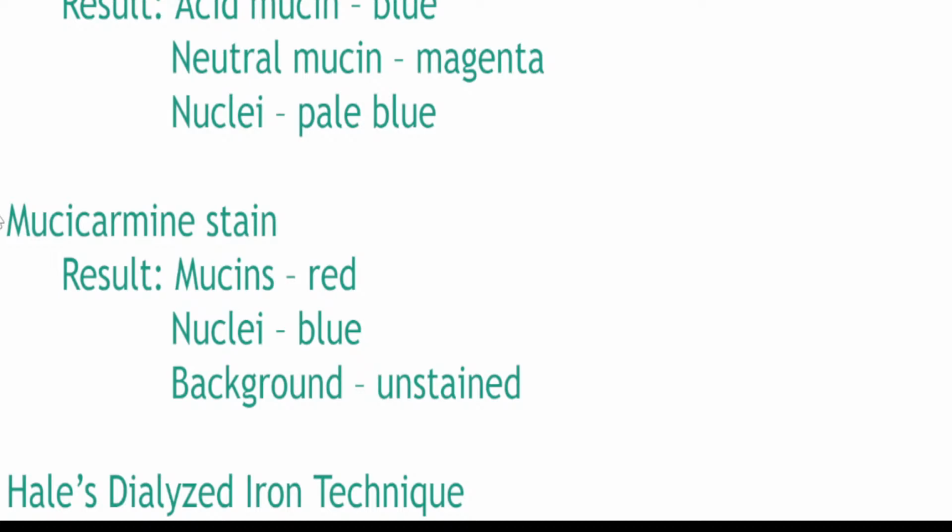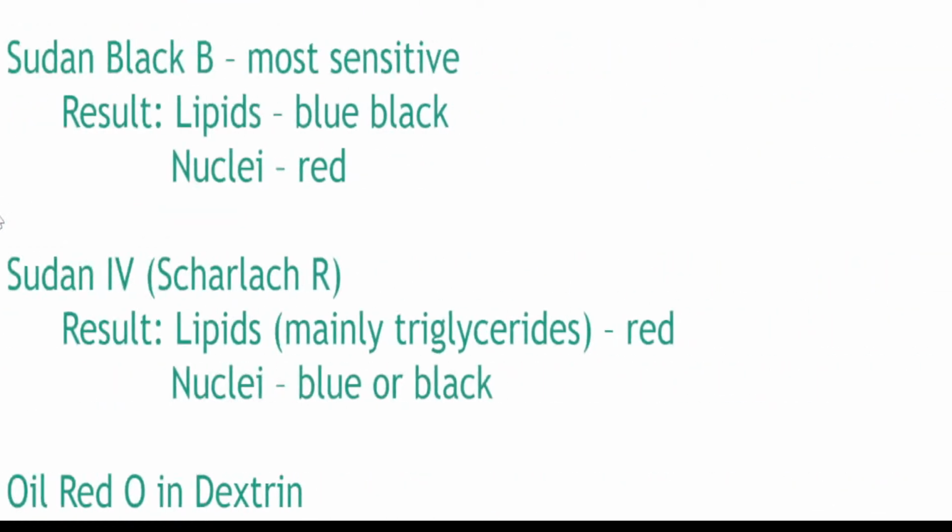That's what is done here. I've not seen that in the Philippines. I've seen that in Saudi Arabia, and I think my friends from Dubai also do that. They send their samples to either Germany or France to correlate the results, whether they are congruent with each other. But if they are different from each other, they have to contact the sending laboratory and check whether there might be a problem with the pre-analytic and analytic considerations of the sectioning.